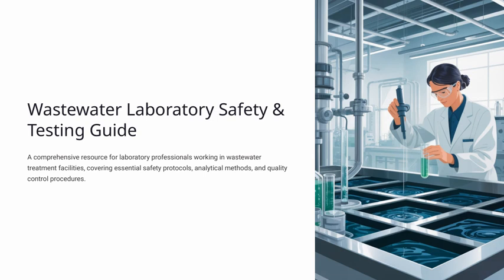We're going to be exploring the Wastewater Laboratory Safety and Testing Guide. This is a comprehensive resource designed specifically for laboratory professionals working in wastewater treatment facilities. Over the course of this presentation, we'll cover essential safety protocols, analytical methods, and quality control procedures to help you work safely and effectively. So, let's get started and dive into this important subject together.